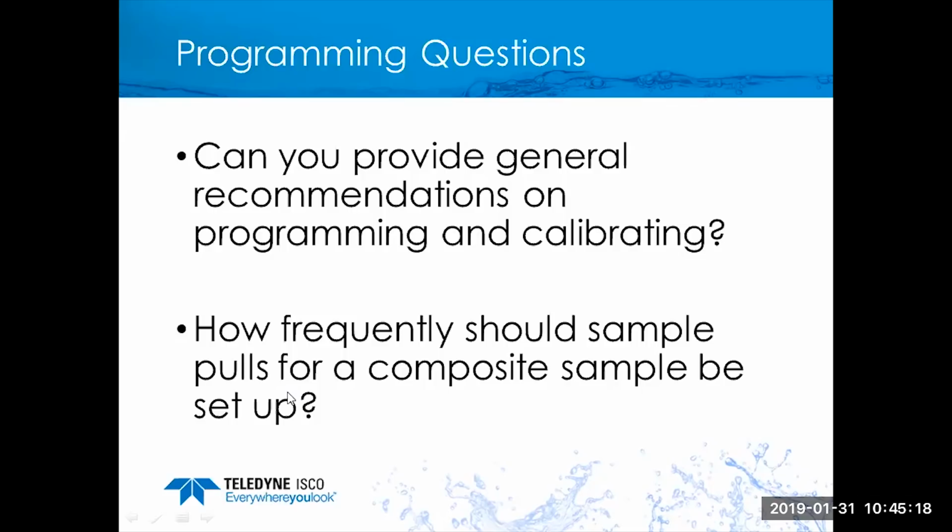Question here about what behavior you should expect from a machine when doing calibration, especially coming from a major change from a previous programming. I assume that question means: if I'm collecting 100 mL samples and one of my normal operating procedures is to validate the accuracy of the volume delivered before moving on to the next task of the day, and suddenly I find that whereas yesterday and the day before I was getting within that 100 mL plus or minus 10 mL, and today I went out there and suddenly I'm only getting 25 milliliters, or I'm getting 200 or 250.